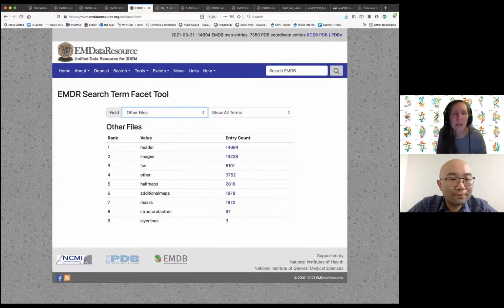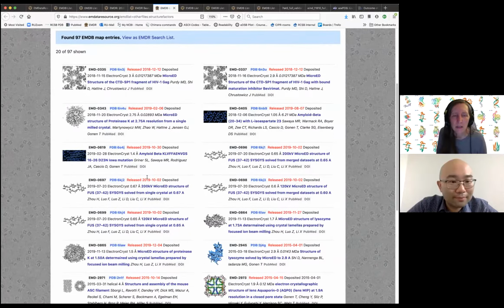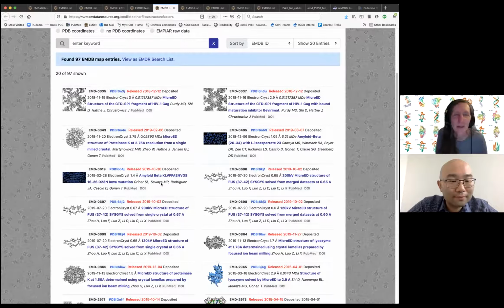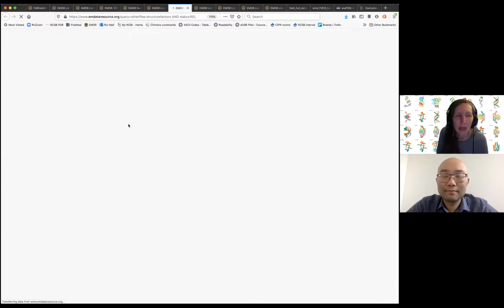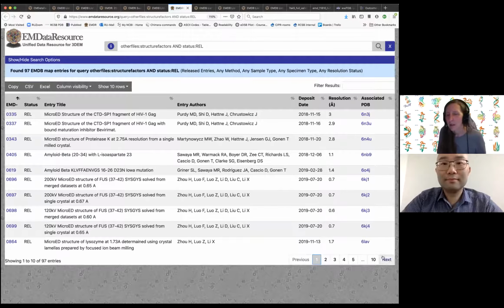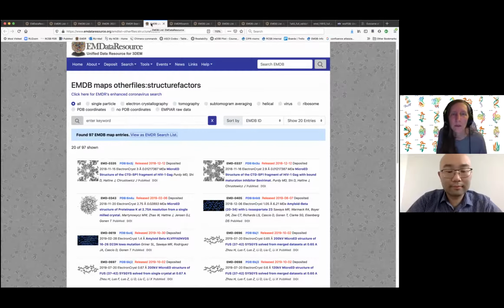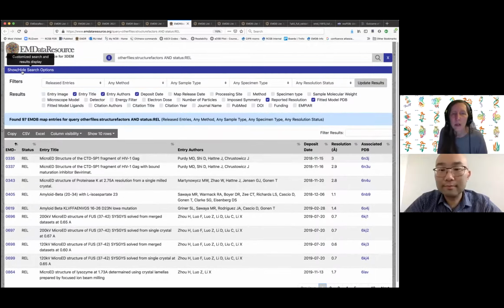And I guess the other thing I would want people to know about is that this kind of list is pretty to the eye, which is why I made it this way, and it's very compact. But the actual original search that I created can be accessed here. And this search allows you to download the results. This list, you can't download the results, but you can just interact with them. But this one, you can add different columns.